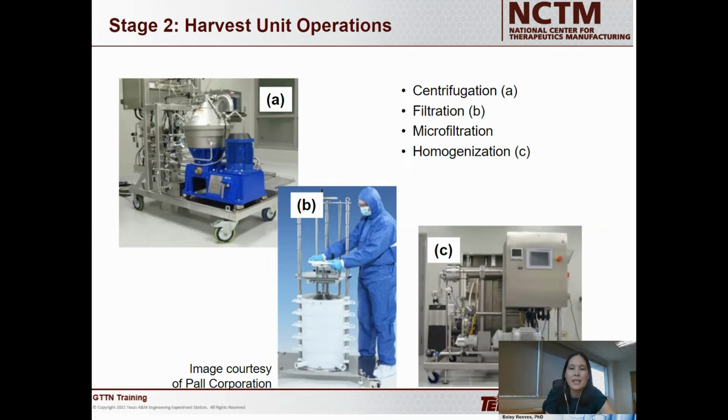In terms of lysis, you can use a homogenizer, which is shown in part C, which is basically a mechanical way to break open your cells. There are also surfactant-based ways that you can do cell lysis as well.